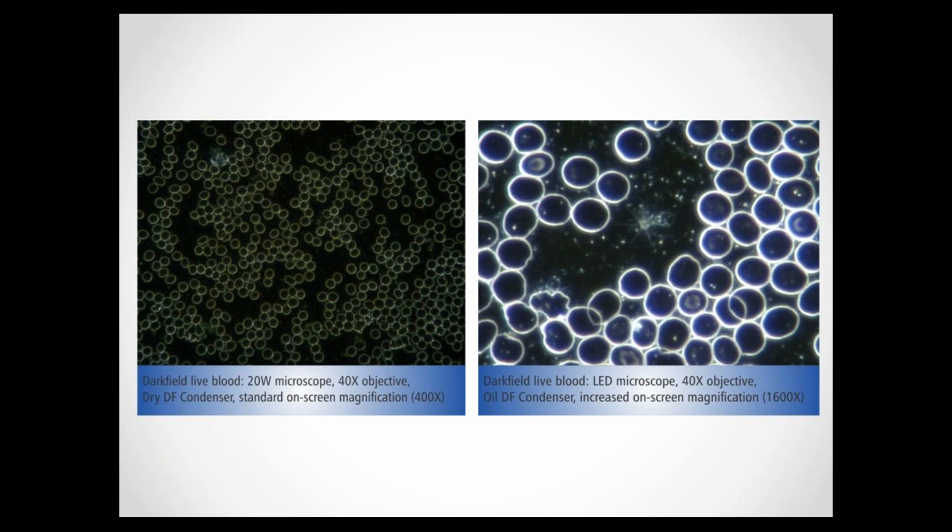What they mean by color corrected objectives is that all the colors of the spectrum will be visible in the viewing field. So in the cheapest objectives, the achromatic objectives, only the central 60% of the field will be color corrected. This means that the color of objects outside of that central area would not actually be correct. The other important issue with regards to objectives is the numerical aperture. This simply determines how much light an objective will allow through into the eyepieces.